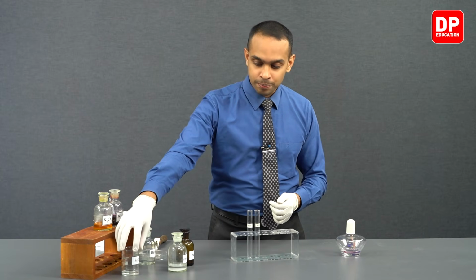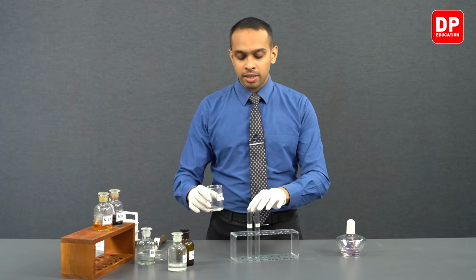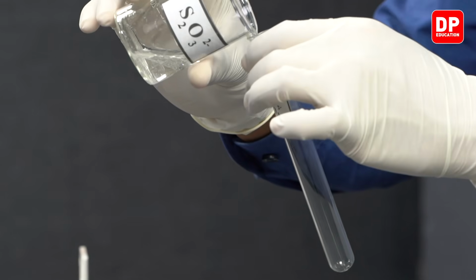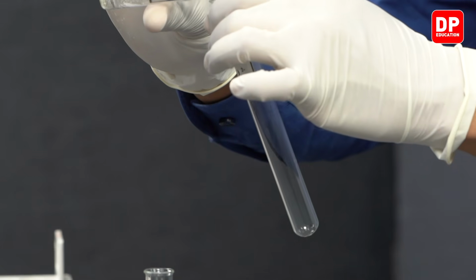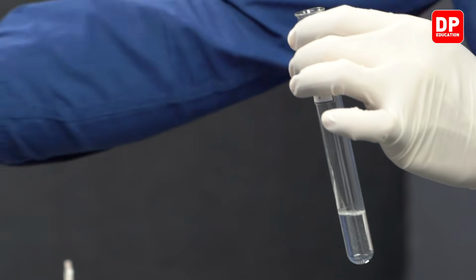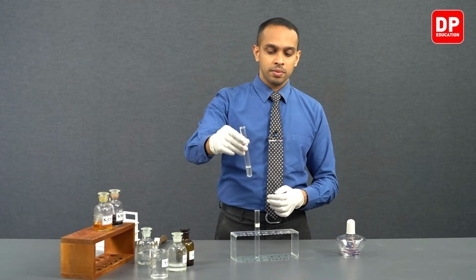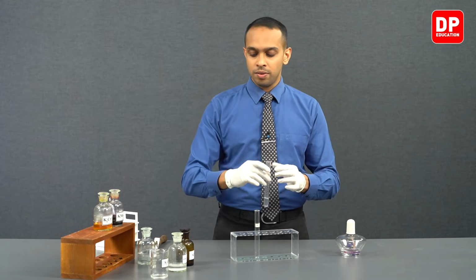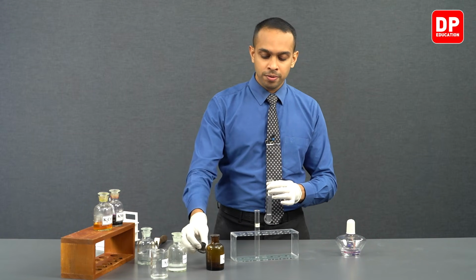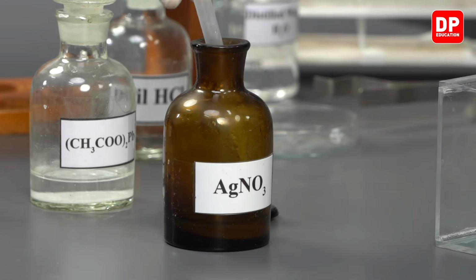So let's take a small amount of thiosulfate ions we have here. So we are taking a small volume of thiosulfate ion solution into a test tube, and to this we will be adding a small volume of silver nitrate.